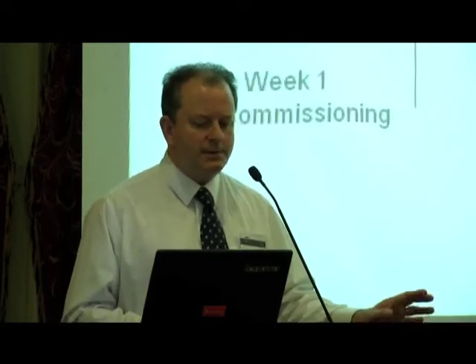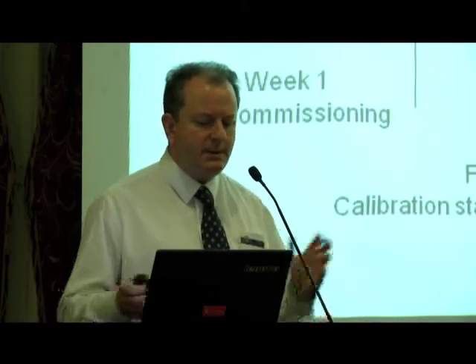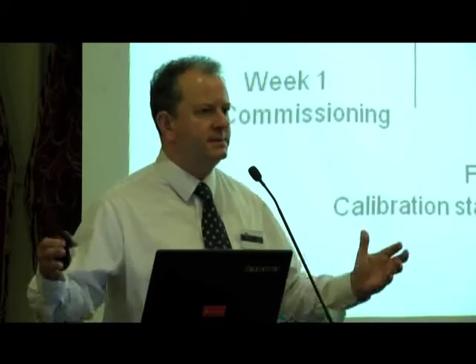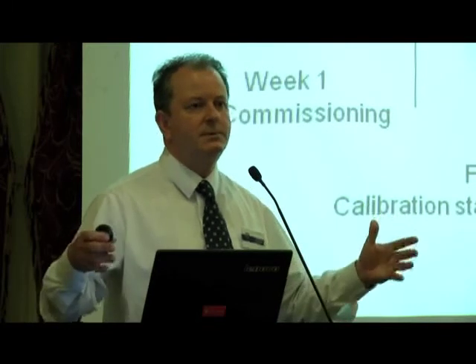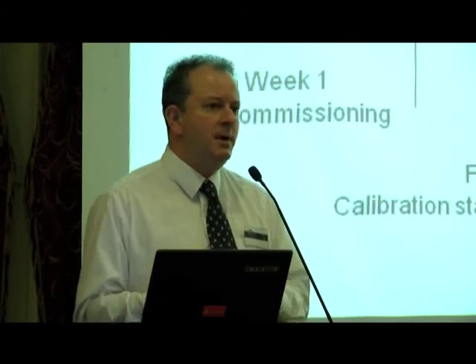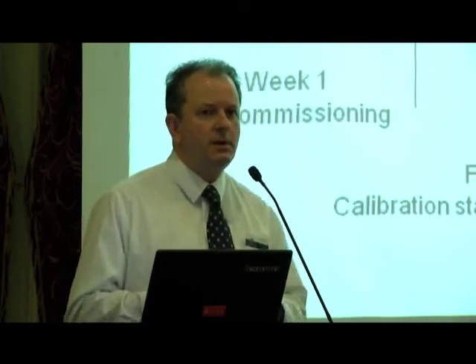So first we look at the commissioning, and then we would start to look at stability over an intensive period of weeks, and then we push out to 6 monthly testing. Ideally, we want an analyzer which will have 6 months or a year stability. We don't want an analyzer where you have to keep going to it each week to change reagents or to recalibrate it.